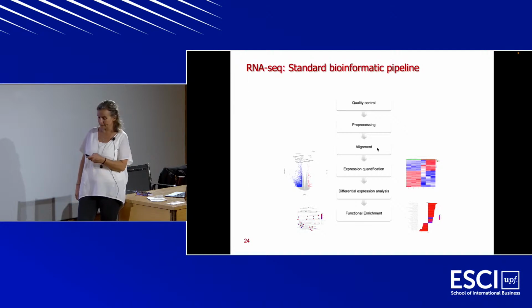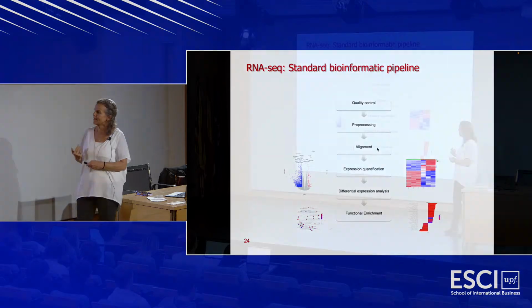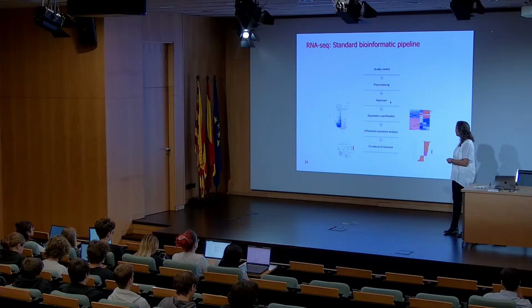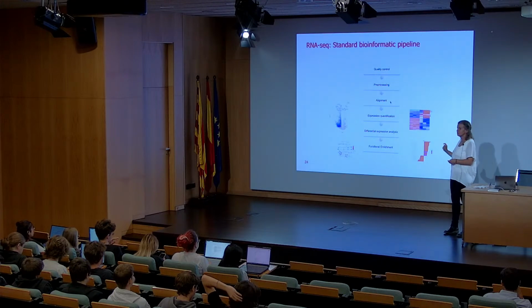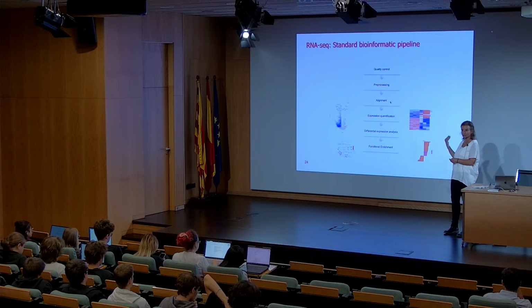So in here, the only steps that we are adding are the alignment and the expression quantification. We need to align those sequences to a reference genome, and this is something that you saw in the previous talk by Tyler, as far as I remember. We do this with these little fragments. We align, we quantify, and that is when we create the expression matrix, the counts matrix that we saw previously.